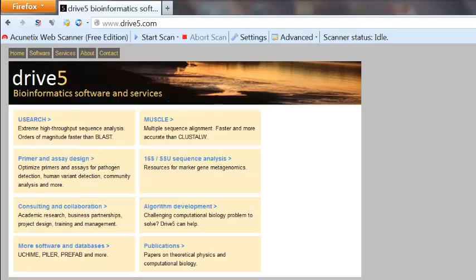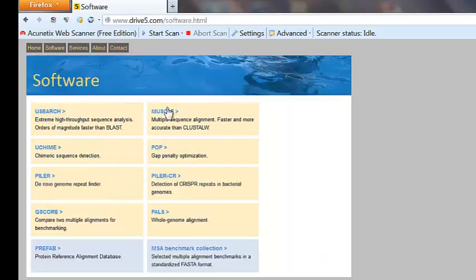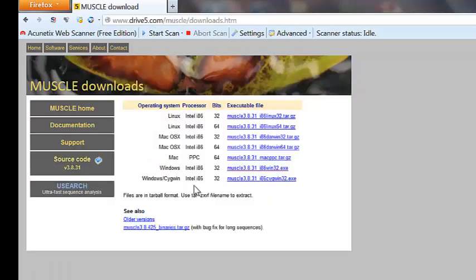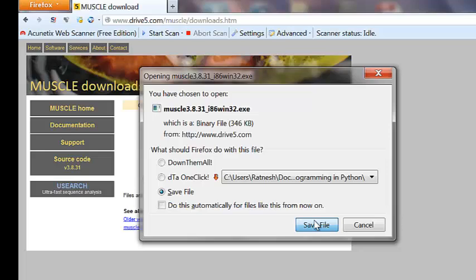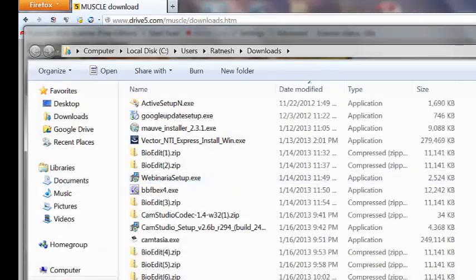First I'm going to download it from their home website. Go to the software options, find MUSCLE, go to the download section, and I'm going to use the Windows version since BioEdit is for Windows. Download it and save it — my computer automatically saves it to the Downloads folder.